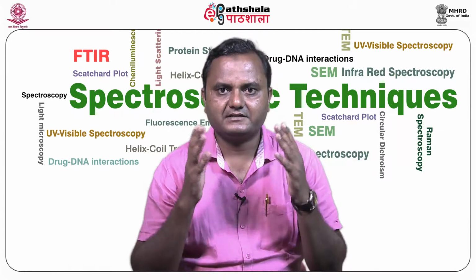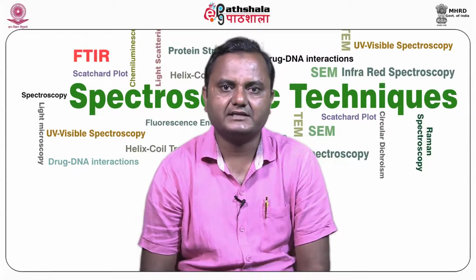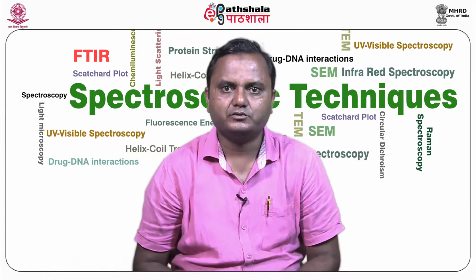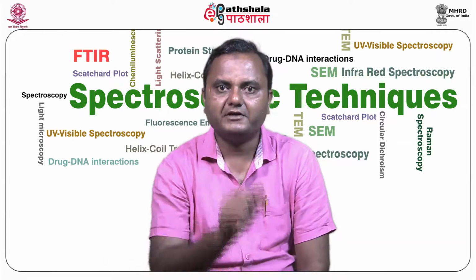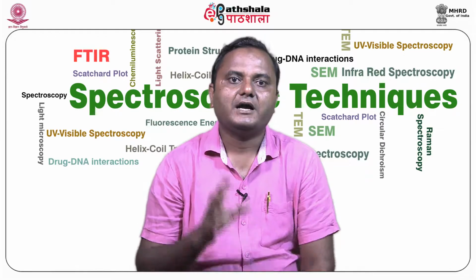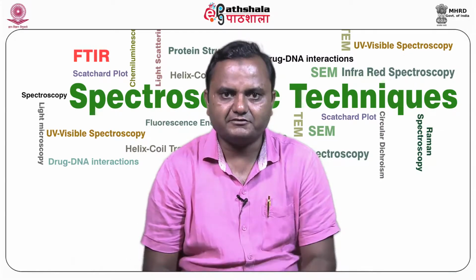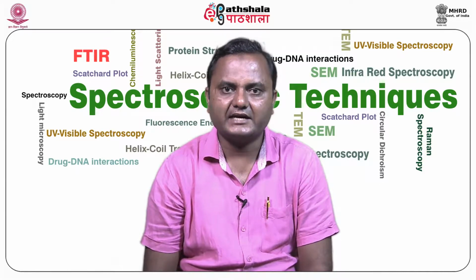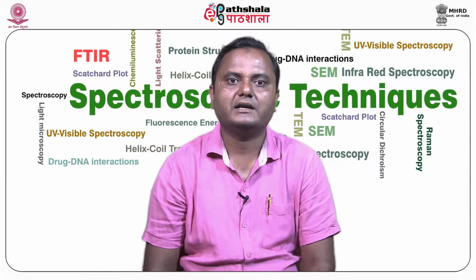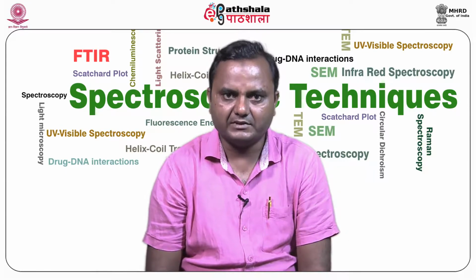In static light scattering, we relate the magnitude of the signal from the photo detector to the intensity of the scattered light and then to the molecular weight of the sample, as well as the sample dependent factor described in the Rayleigh equation. The measured intensity of the scattered light will depend on a large number of instrument dependent variables.